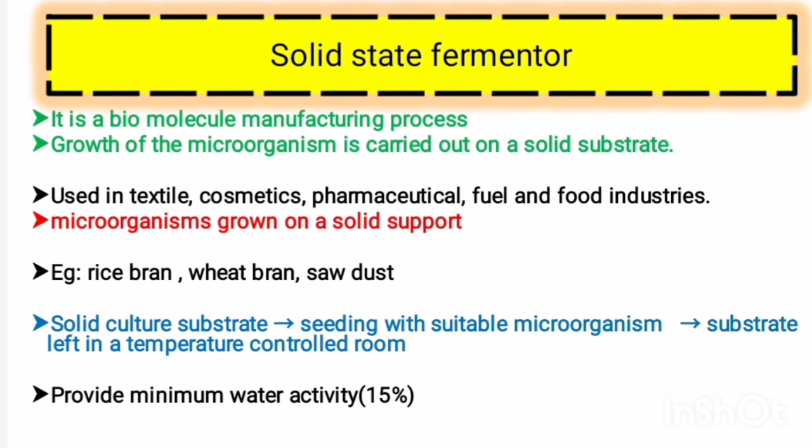The solid medium comprises both the substrate and solid support on which the fermentation takes place. The substrate used is generally composed of vegetal byproducts such as rice bran, wheat bran, sawdust, etc.